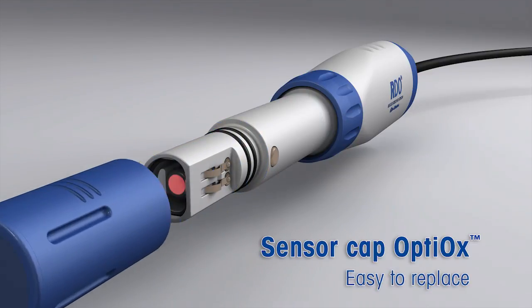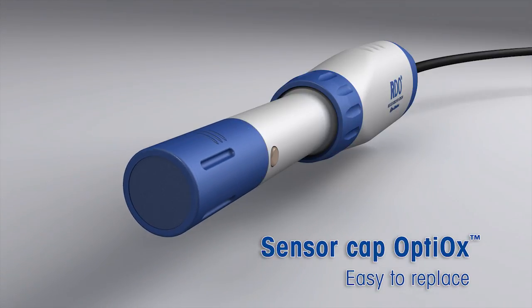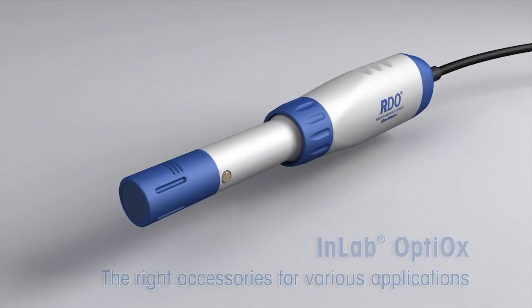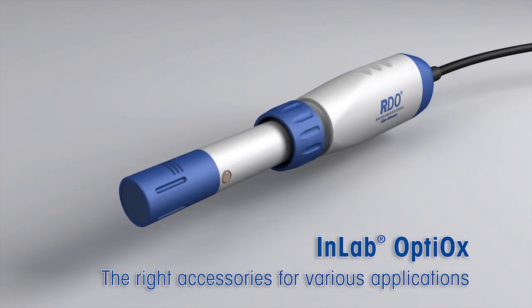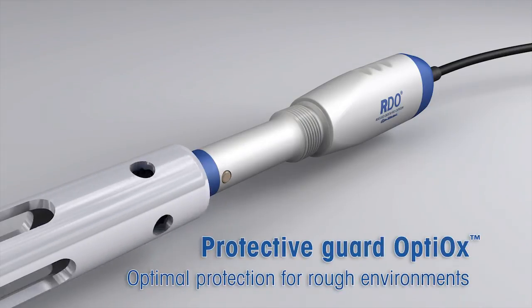Never has the change of a sensor cap been so easy. Just take off the used cap and snap on a new one. Ready. Thanks to the robust design and the tailored accessories, the in-lab Optiox is a true all-rounder.